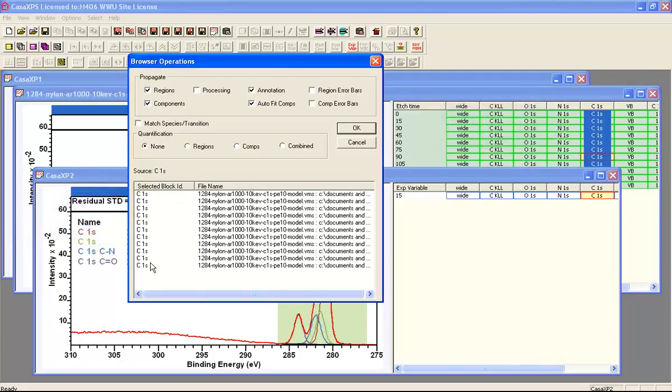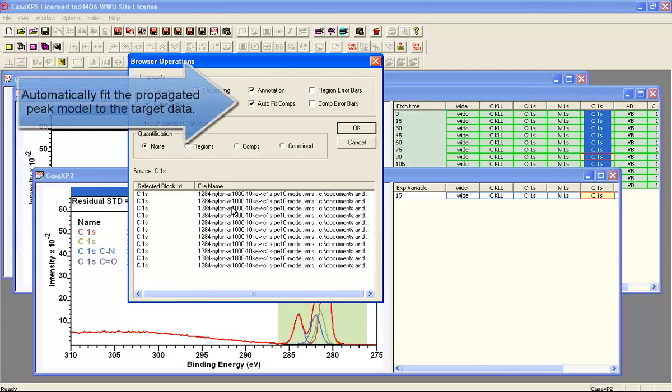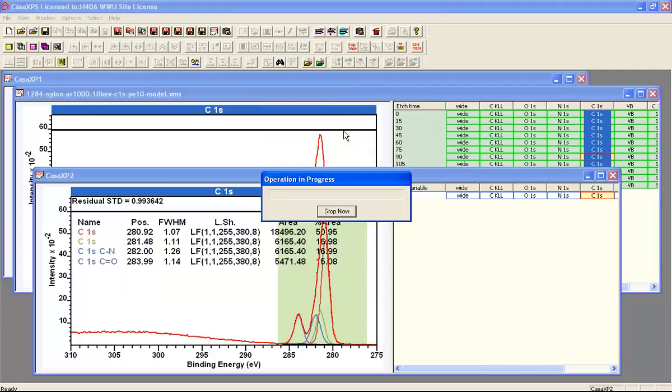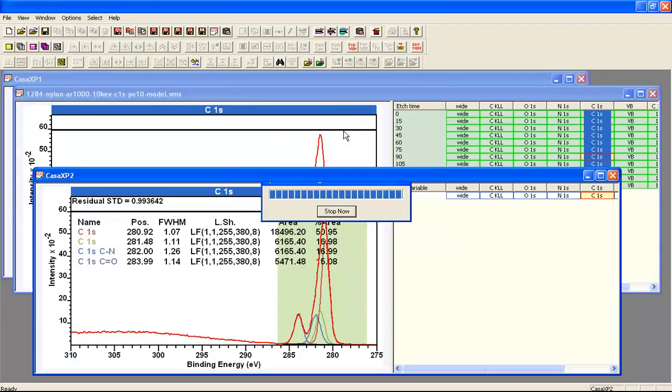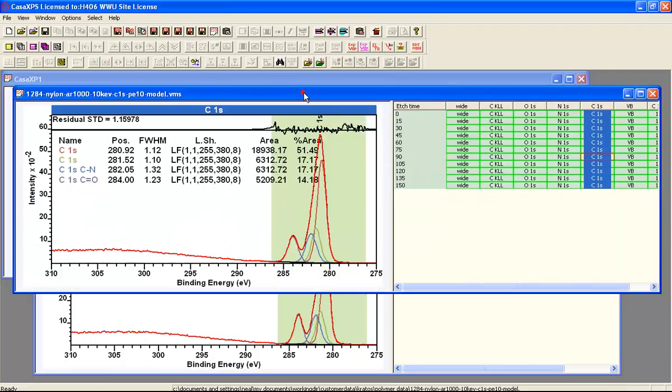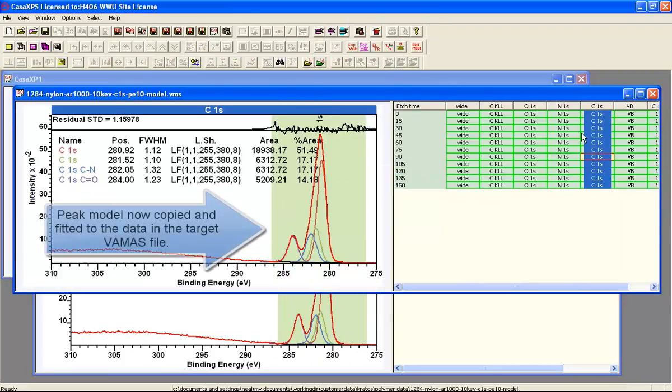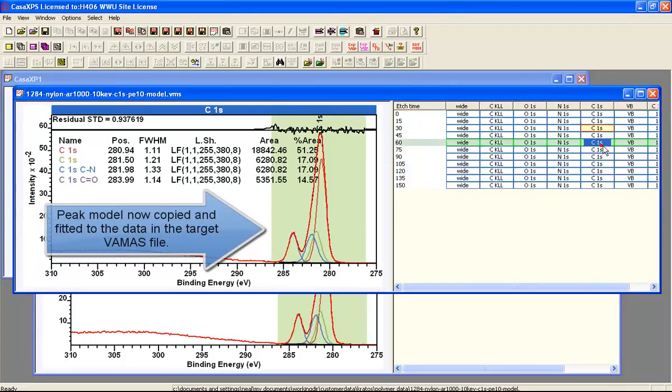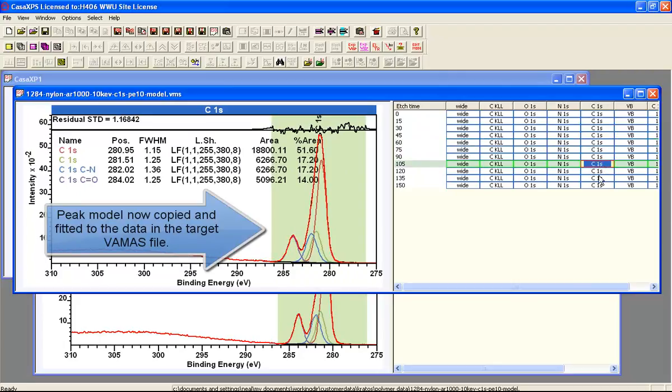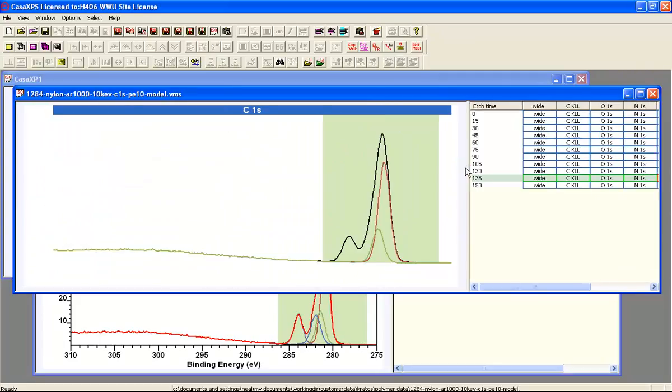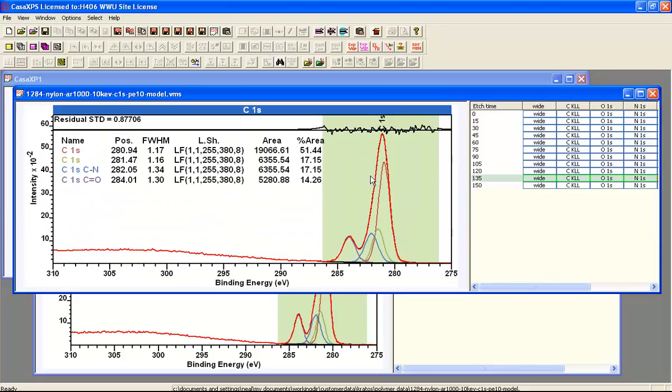It lists the file name also because you can have more than one file with these selections made. And then if I press OK, these operations will be performed. So now looking at the data after the propagation, you can see that each one of these carbon 1s now has the peak model and it's been fitted to the data.